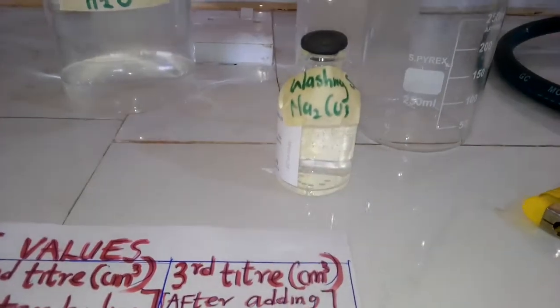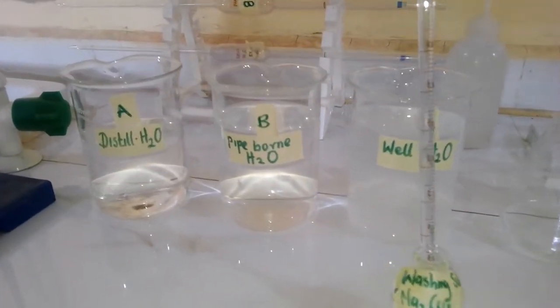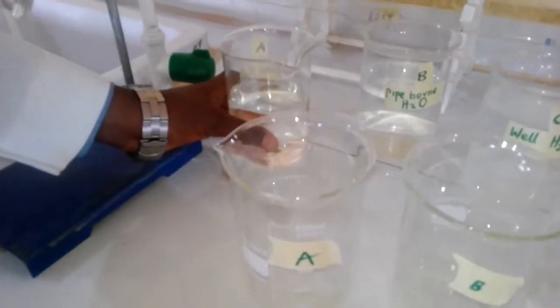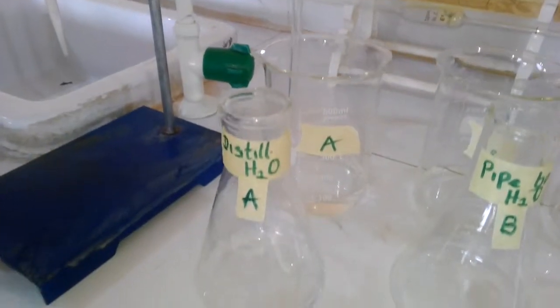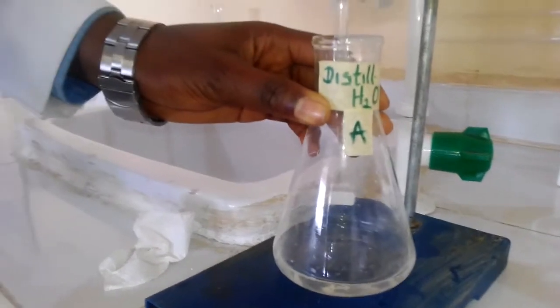For the third titration, chemical, which is washing soda, will be added to the 3 water samples. Add few drops of washing soda into all the 3 water samples and allow it to stay for some hours. Decant the uppermost layer of each of the water samples into different beakers, and then pipette 25 ml each into each of the conical flasks. Then titrate the water samples each afresh with the soap solution.